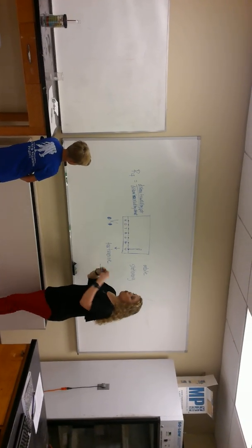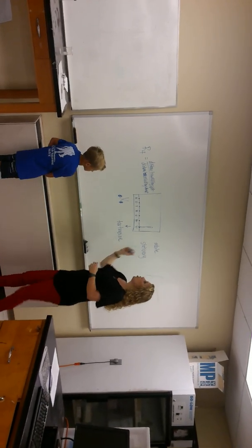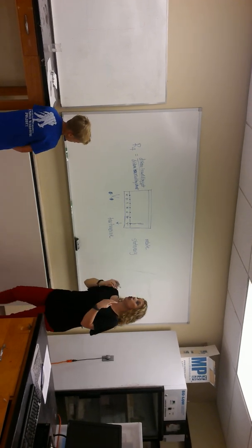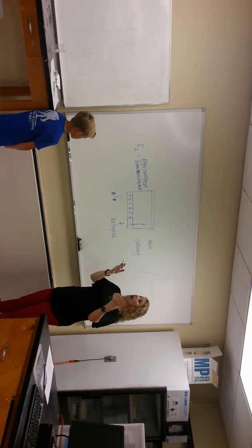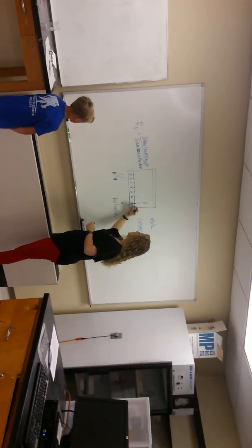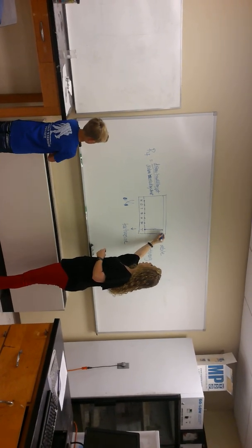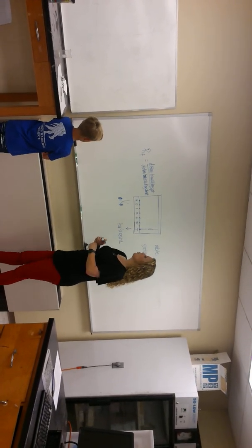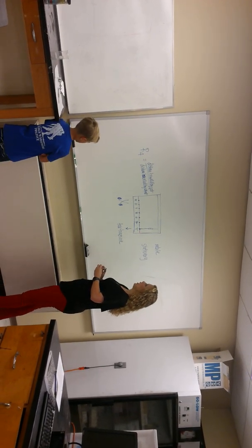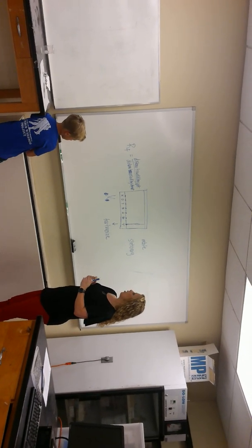For the solvent, once you're done, you're going to get the paper out. It's going to be wet. You want to take a pencil and mark across the top that solvent front. You need to do that because once it dries, you won't be able to see where that is. So mark across that solvent. And then once it dries, you want to get the distance from here up to the solvent. That is this portion here, okay? So don't measure from the bottom, you measure from here, okay? All right, so that's how we end up calculating our Rf factor.